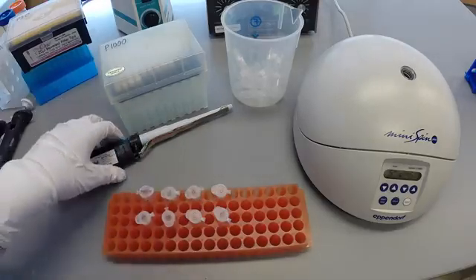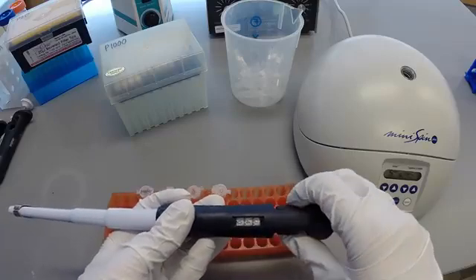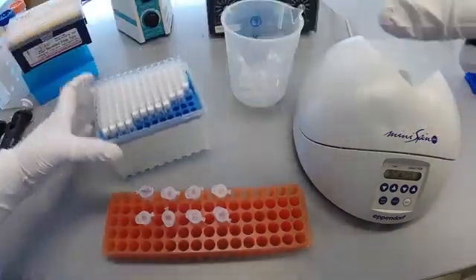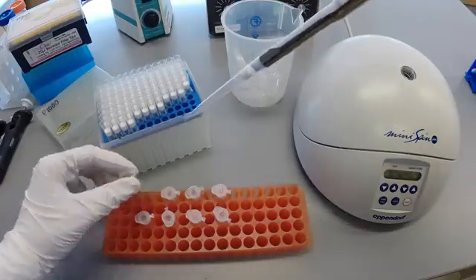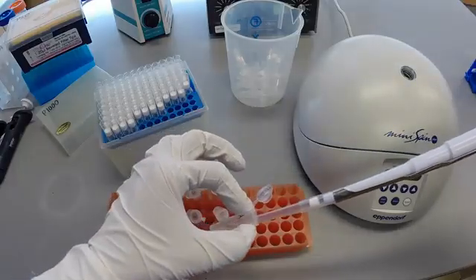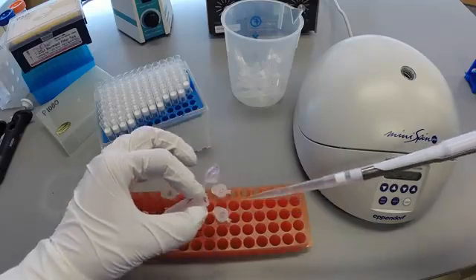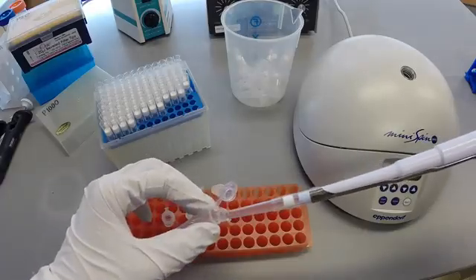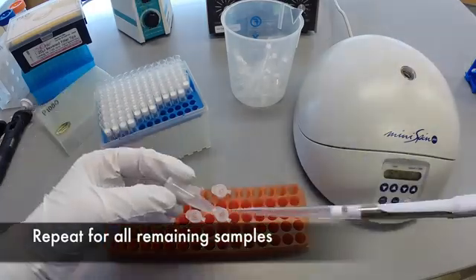This pellet contains the impurities in the solution. The DNA is in the supernatant. Using the P1000, transfer 400 microliters of supernatant, which contains the DNA, to the new tube. Place the tip on the opposite side of the tube from the pellet and draw up slowly to avoid disturbing it. Repeat this process for the remaining samples.